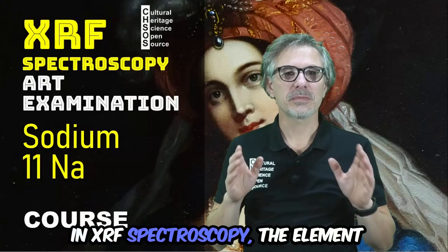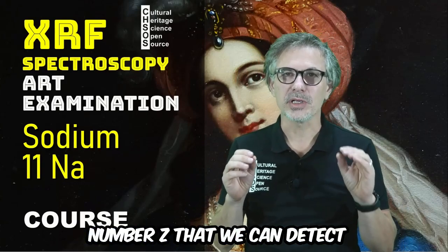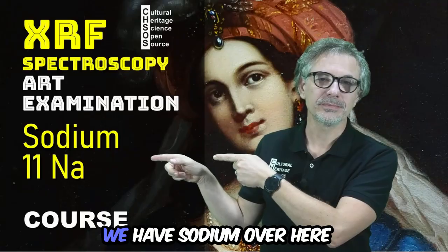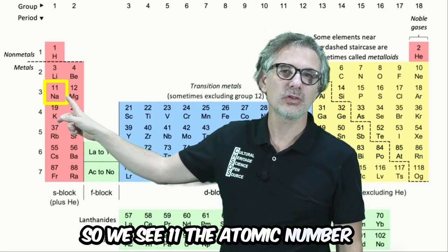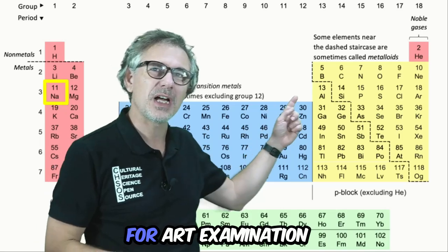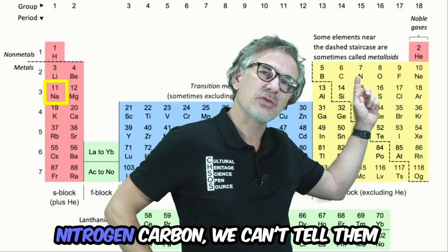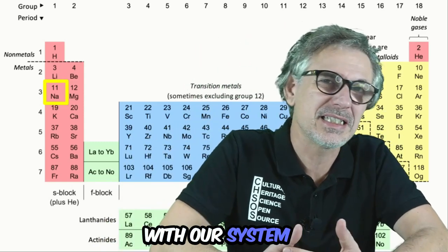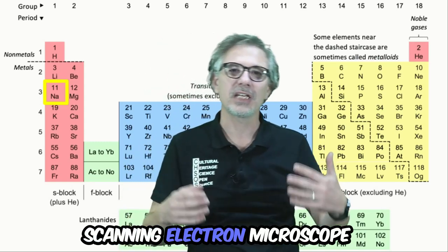In XRF spectroscopy, the element with the lowest atomic number Z that we can detect is sodium, 11. We have sodium over here, so we see 11, the atomic number. Before sodium there are some elements of interest for art examination, like nitrogen and carbon, but we can't detect them with our system. These are elements that we can map using the scanning electron microscope.